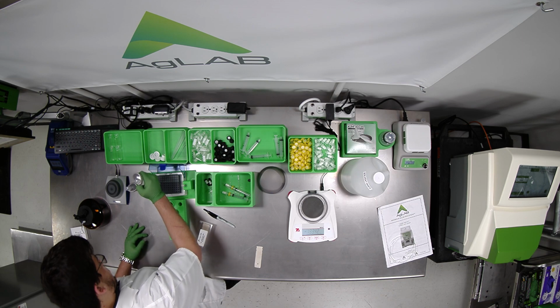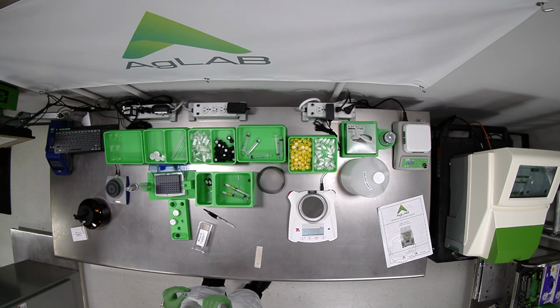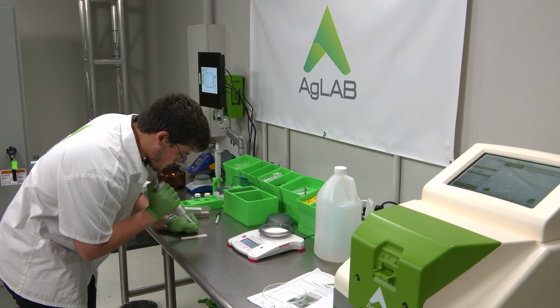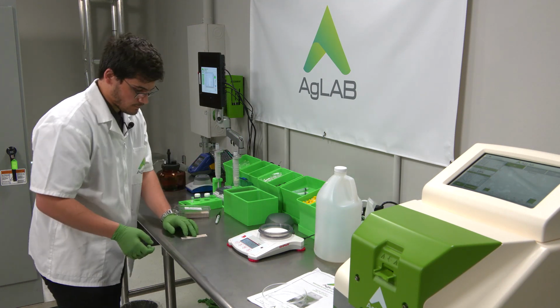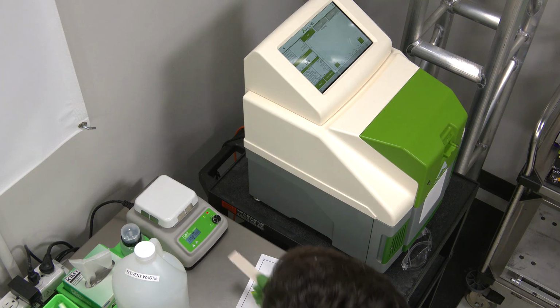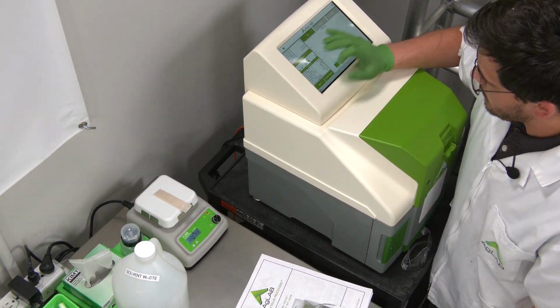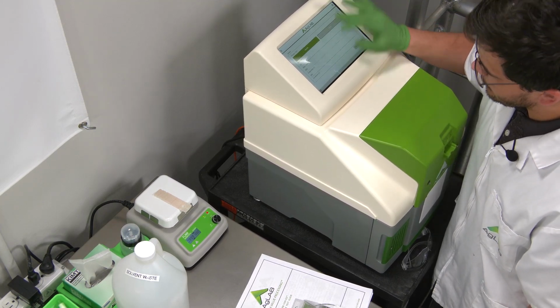Five microliters for the drop onto the swab. Into a hot plate, and we can go ahead and enter our information for this next sample.